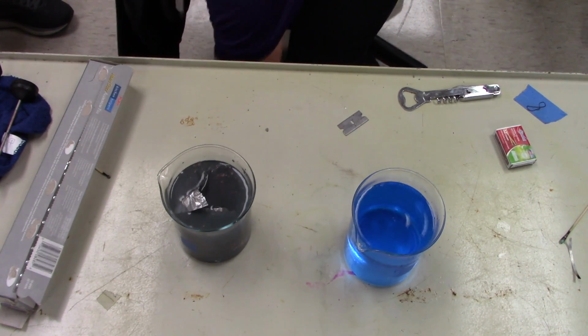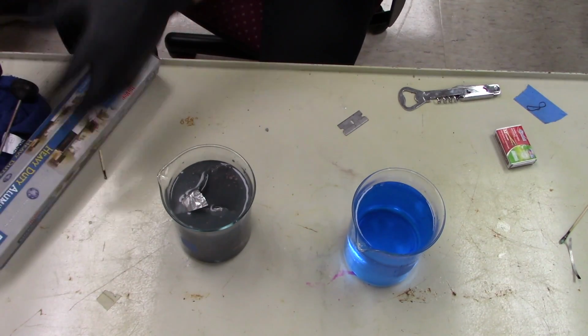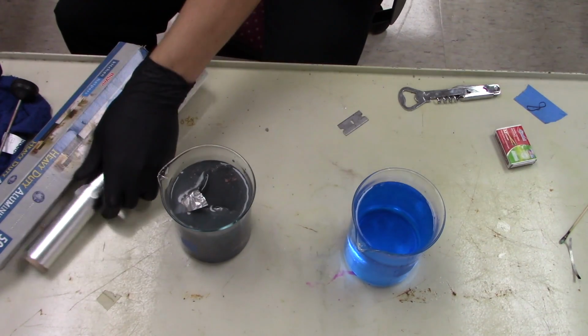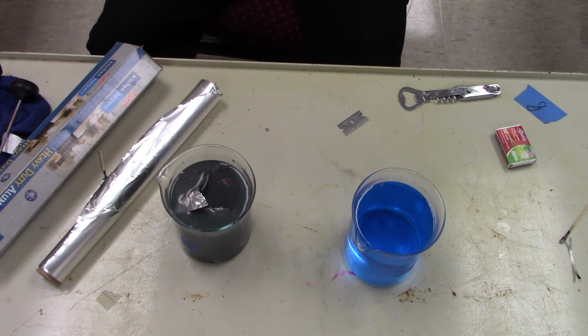So what we're going to do is we're going to put aluminum, just raw aluminum foil, pure aluminum, into it, and it's going to do a replacement reaction, what we call a single replacement reaction. So I'll roll this up so we have lots and lots of surface area.